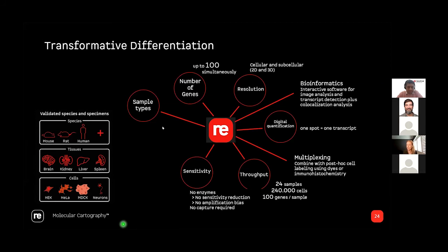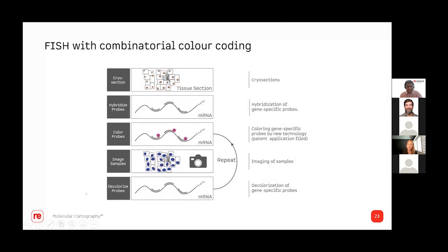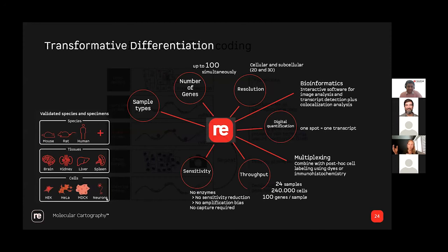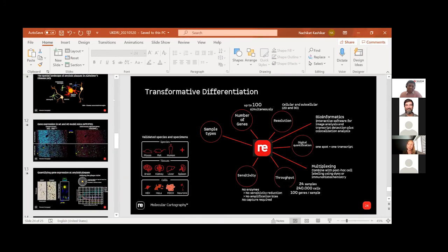Okay, thank you. I have a question, and I really like towards the beginning of your talk how you can see expression in the neurites. My question is, it looked from the image you showed that it was only the neurites that are still relatively close to the cell body. And bearing in mind, let's say in the mouse cortex, you can have an axon that's 1 millimeter long. How far out can you go?